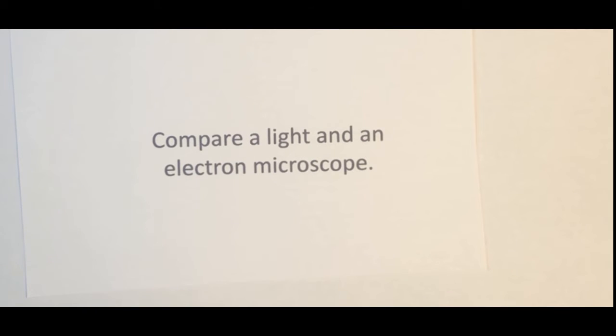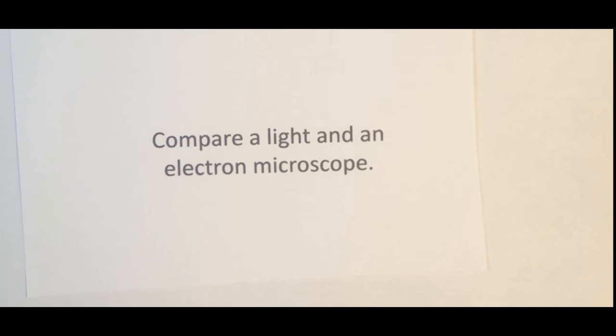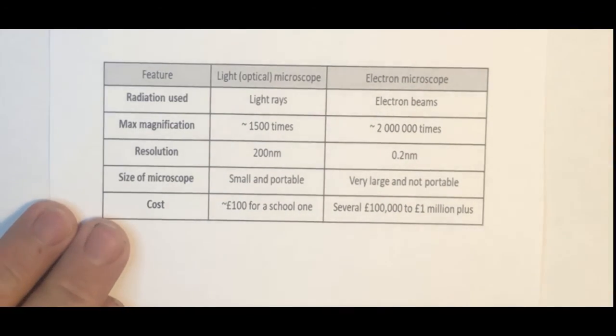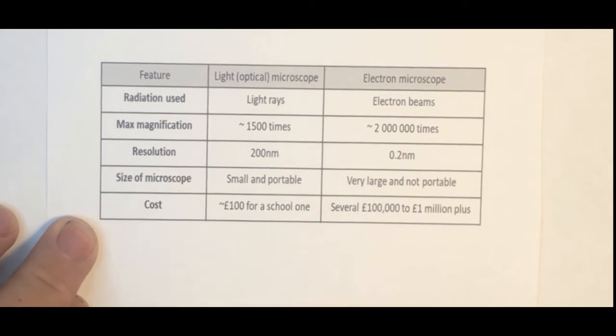If you just go into Google and put in electron microscope pictures, they are absolutely incredible, the way that the pictures can actually be presented. Now, comparing a light and electron microscope, you need to remember these different features down the side here to get the best possible answer for this.